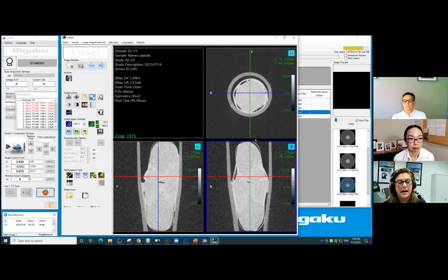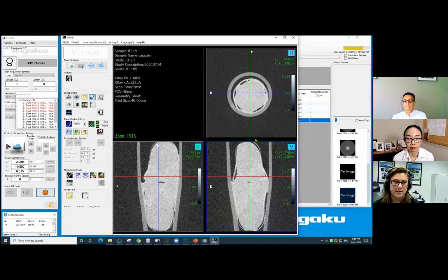One thing I'll tell you is that this is a generic brand, and there are other brand name fast-acting pills. I chose an experiment very similar to this in that webinar that I've mentioned a couple of times. In that case, it's very difficult to capture with a 2-minute scan because things are already exploding out of the pill within that time frame. So this is an easier experiment to do just because it's generic and happens a bit slower, but it's still pretty fast.